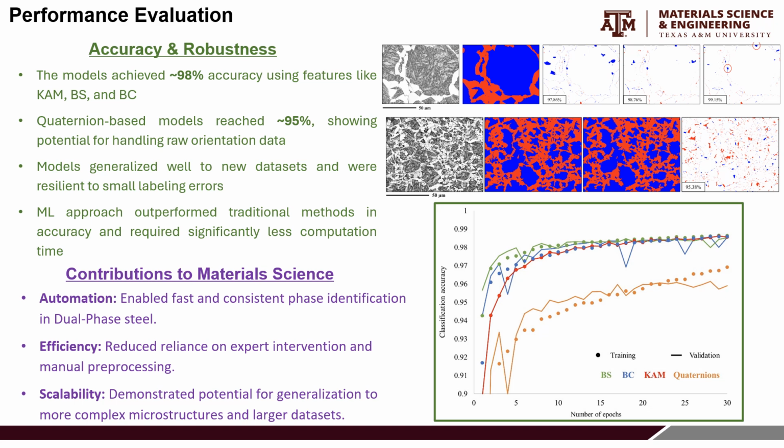So the idea behind this is that it can be applied to a wide range of microstructures comprising multi-phase and complicated phases, and it is able to segregate and differentiate, as well as identify, the individual volume fractions of those phases within the specific complicated microstructure and larger data set at an accuracy which is much higher than done manually.